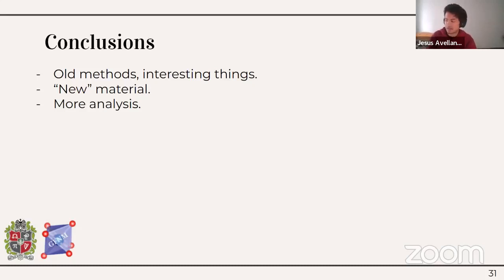But basically, to summarize, based on the results presented here, it is possible to affirm that the double perovskite can be cataloged as a ferromagnetic semiconductor, being a candidate for applications in spintronics since its multifunctionality at room temperature allows considering it as an alternative in the design of ferromagnetic transistors or devices based on polarized spin currents. Those are the final results that we have from analyzing this data.